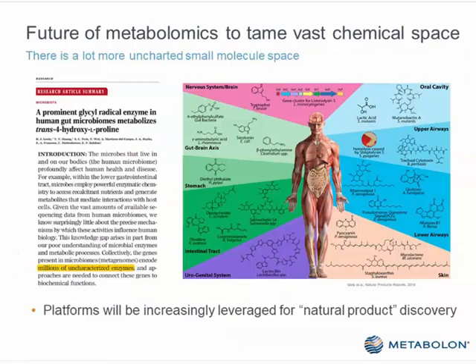One of the things I did want to mention, though, in terms of the microbiome is that this is a big space in the future, I think, for novel metabolism. So a lot of the metabolites that we've measured, for instance, over 5 or 6 years, and now we're identifying what those molecules are, many of these are turning out to be other bacterial metabolites. And so, what we put this slide in showing is that I think in the future, there's going to be a lot more of combining this metabolomics to the genetics of the microbiome. But I think this is a huge discovery area as well in terms of new biochemistry that is probably very important to different health consequences. And we're just kind of scratching the surface biochemically understanding this right now.